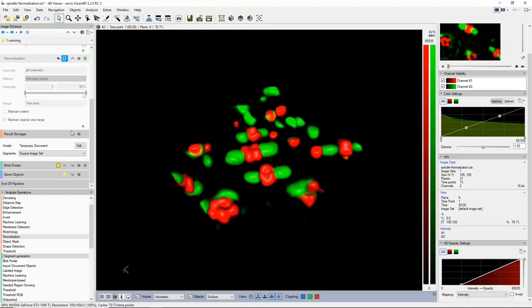We generally recommend that you have about 5 times as much free space on your hard disk as the data you're trying to process. That's the kind of rule of thumb. And if you want to review this, by all means do and check out the recording for our first webinar where we went into quite a lot of detail on this.